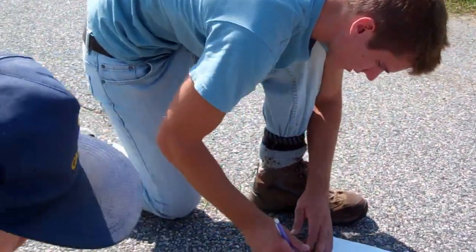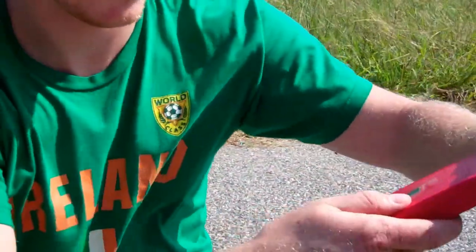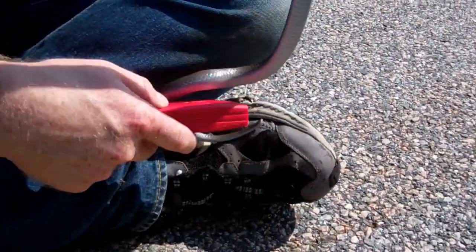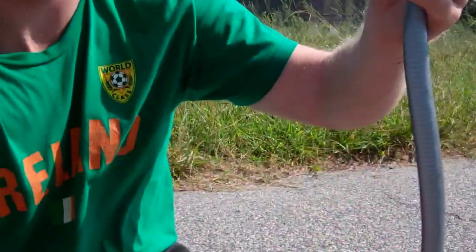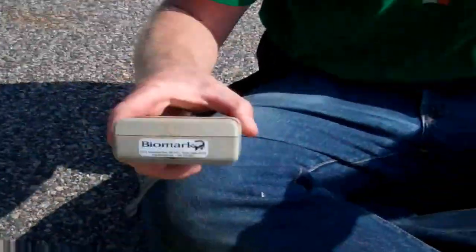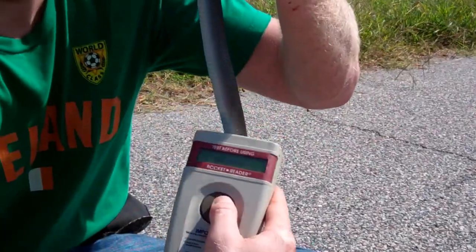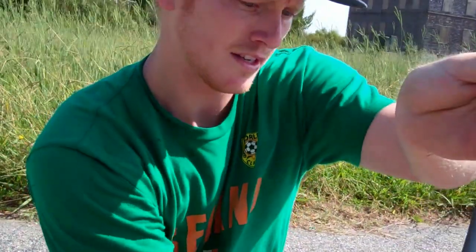Now we just need to mark it — let's see if it's a recapture first. We use this machine from the company called Avid, and it's looking for a PIT tag — a passive integrated transponder — usually underneath the scale. This machine didn't find it, so we'll try the newer machine. A recapture means we've caught it before and it's been marked, so we can note things like growth or if it received an injury. It looks like it's a new snake, which is awesome — that means the population is pretty good out here.